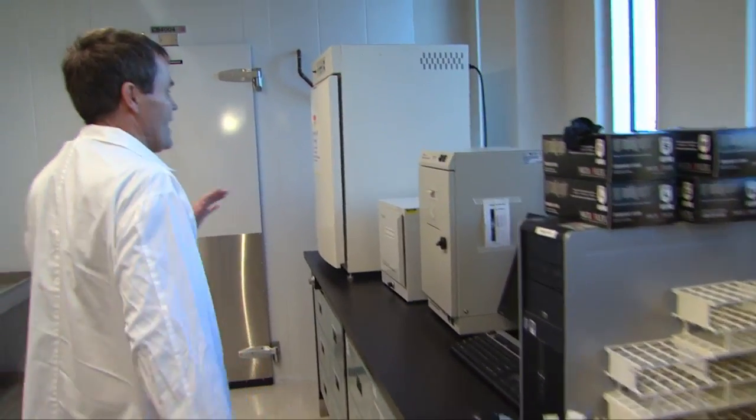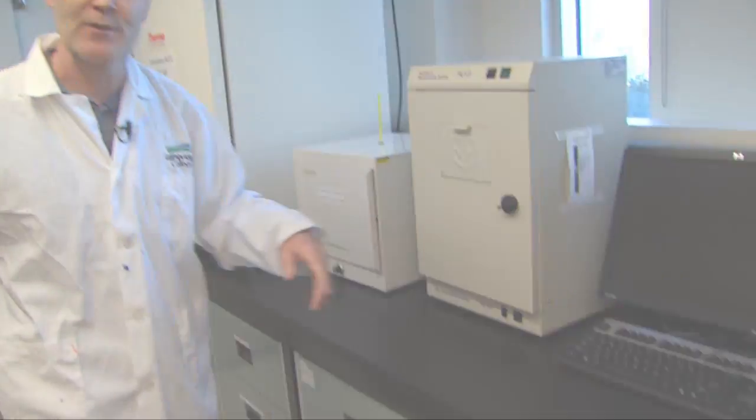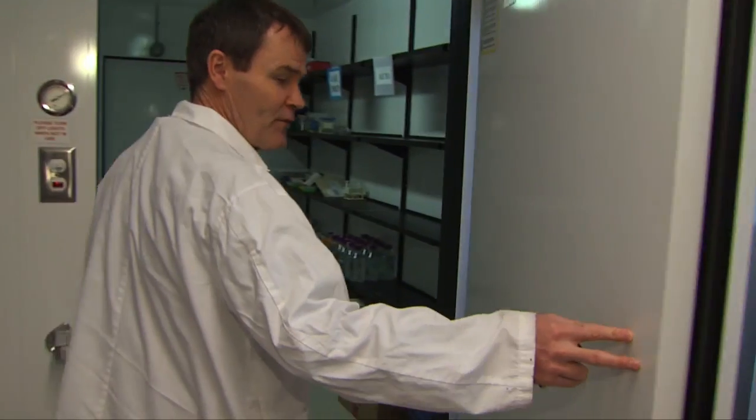You'll be using those right from the very first lab. Going through here, we actually have a gel documentation system. We use this for looking at DNA. If we're doing DNA isolation we can actually put that on an agarose gel and then view it on this and put it in the computer.